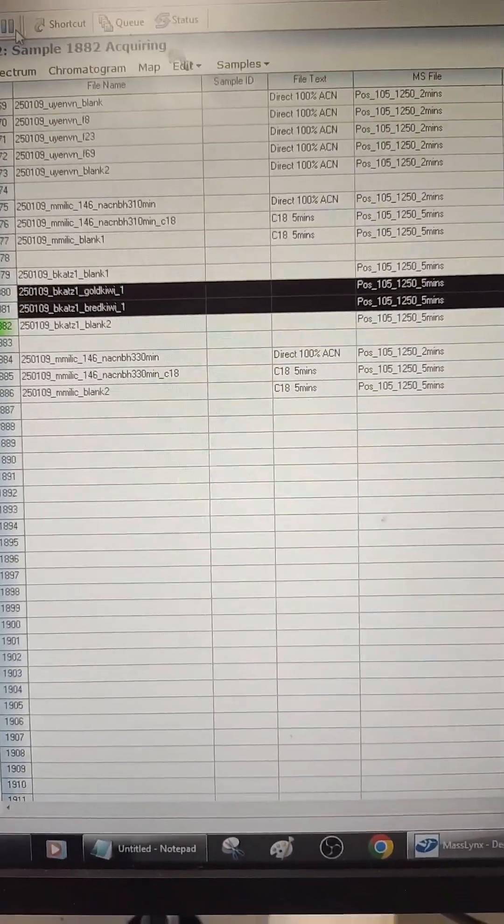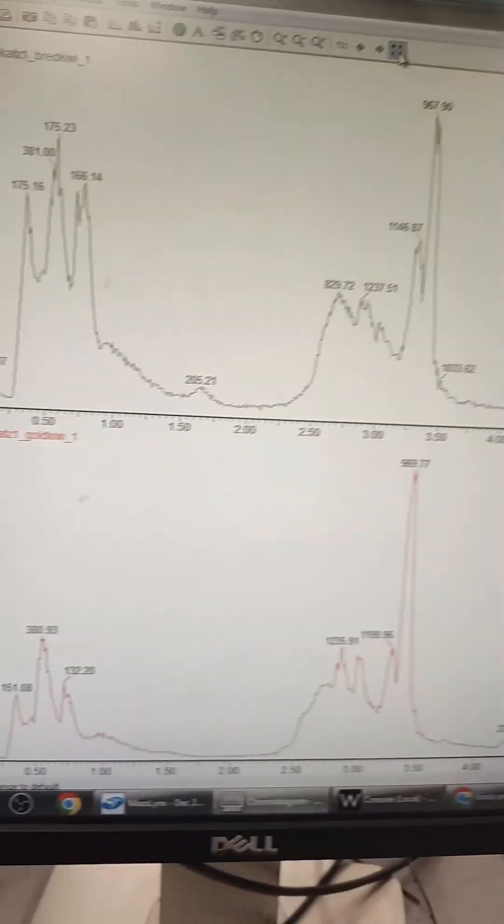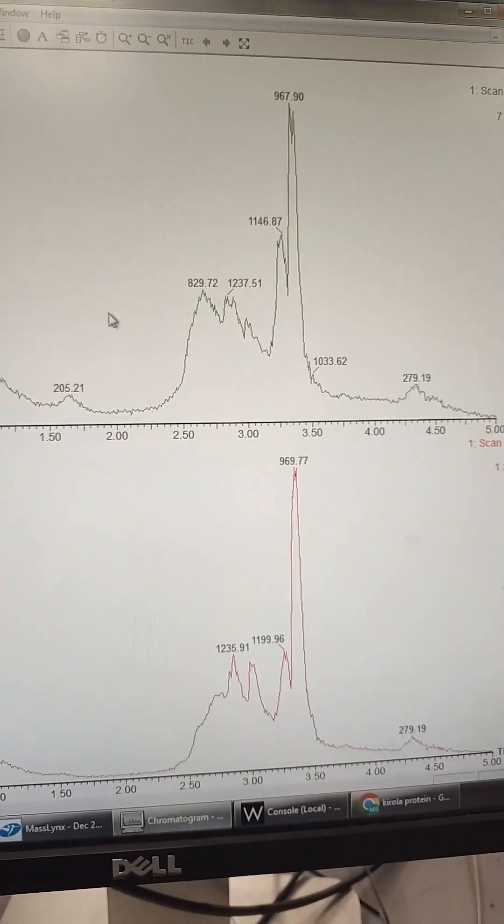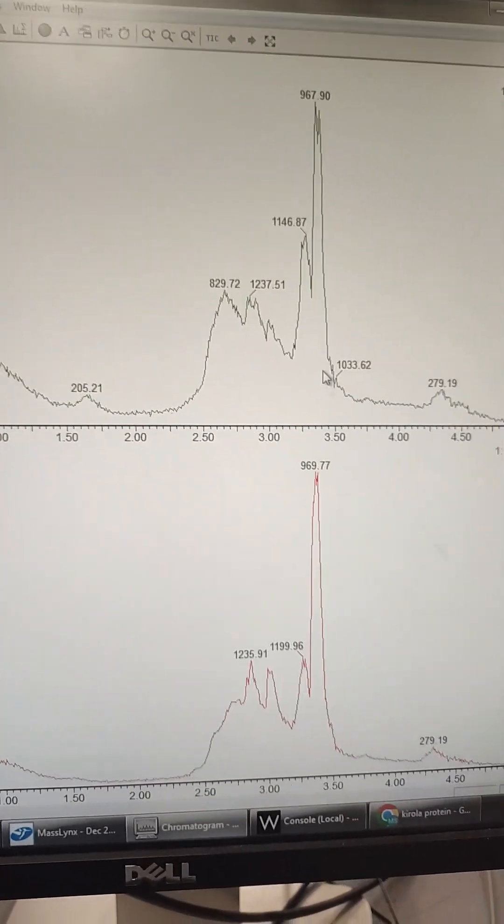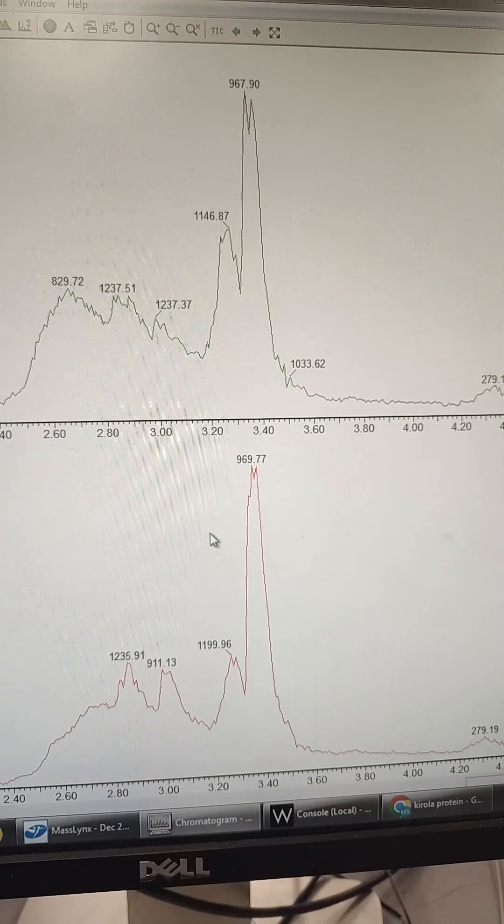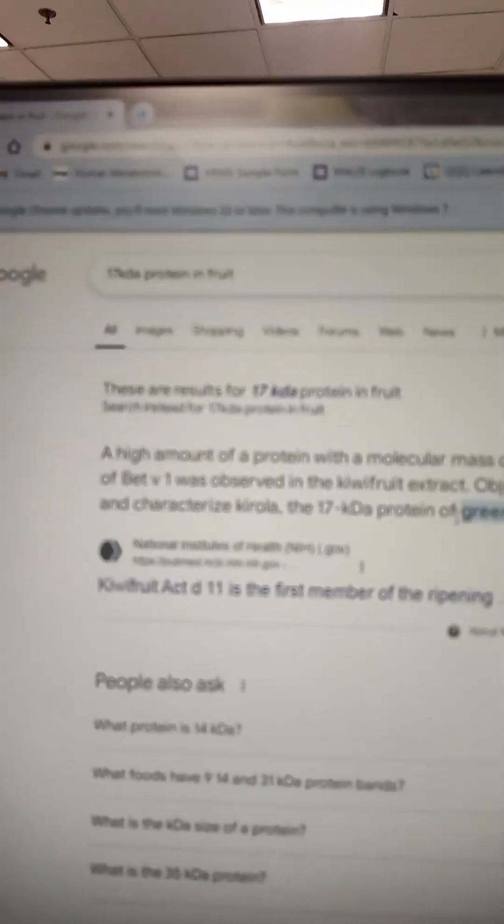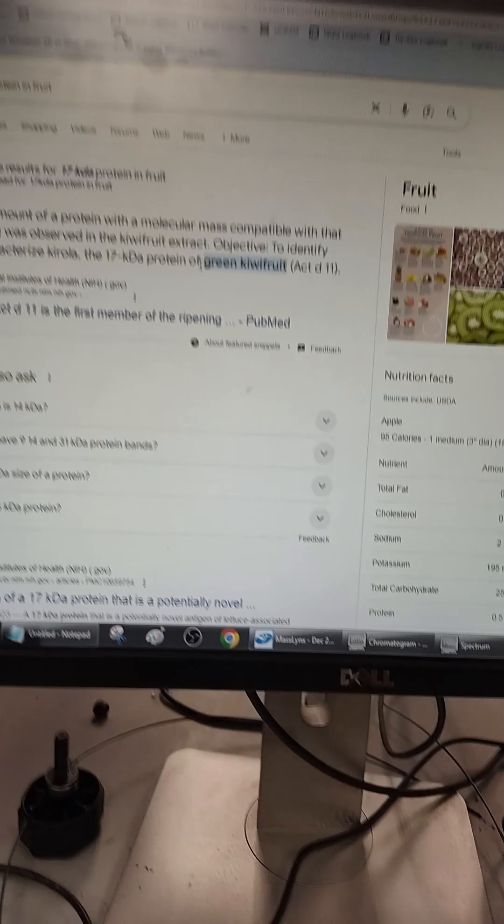Here we go. Gold kiwi versus the red kiwi. There are not a lot of differences. We do have a difference right here in the red kiwi. And then this big peak right here that's in both of them. Oh yeah. But look at this.